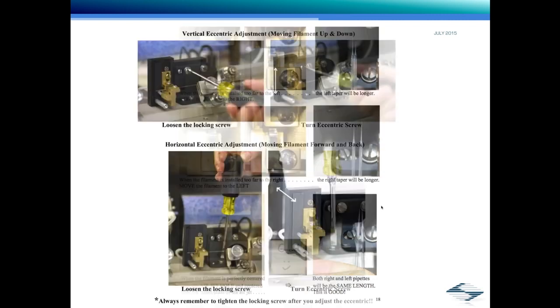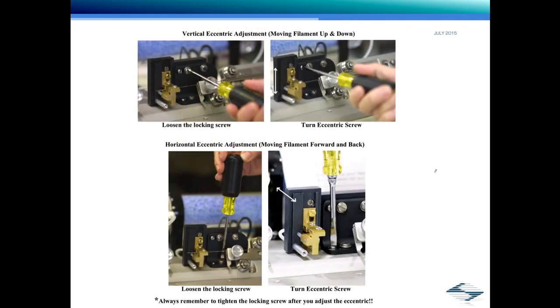The next thing you want to do is make sure that glass is perfectly centered in the box or the trough filament. With the box filament, you want that glass right in the middle. If it's sitting too high up here, it's going to see too much heat. It's going to pull out unevenly. So you really want it perfectly centered right in the middle of that box filament.